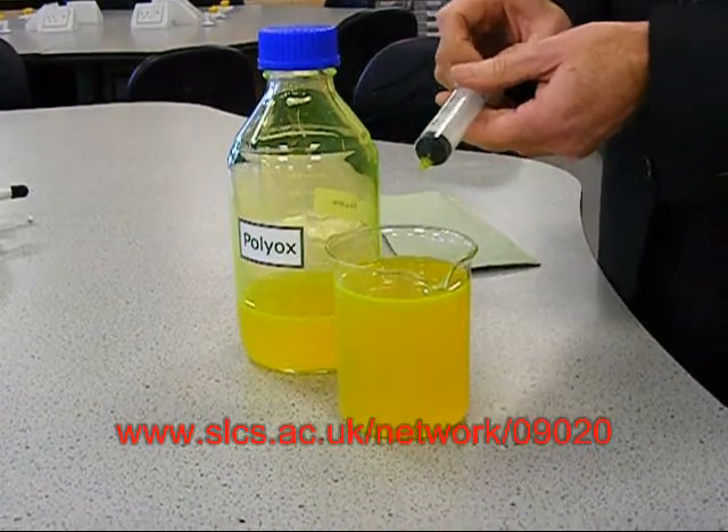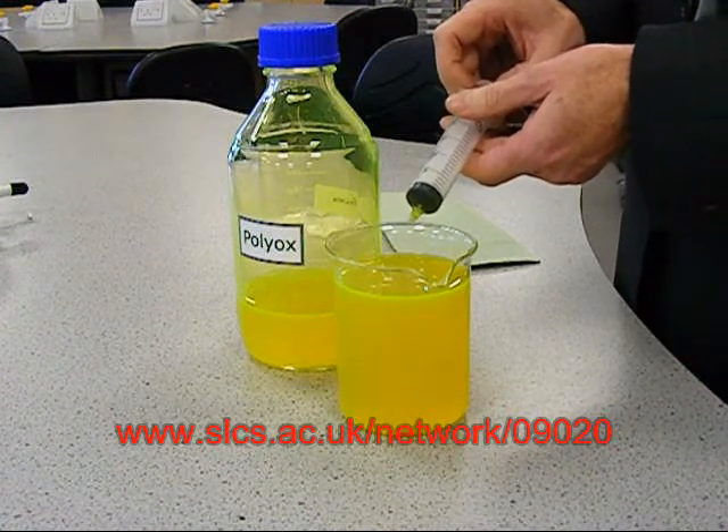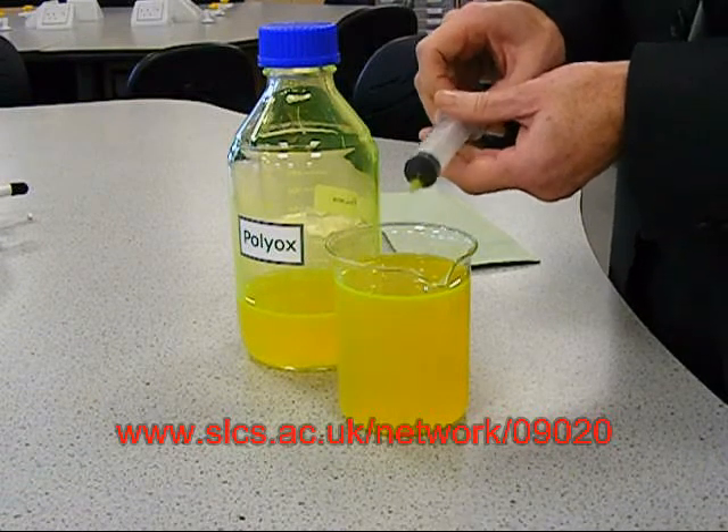One word of advice: make sure that you're in your best white suit before trying this. The children will be incredibly impressed when you spill the mixture over yourself, because it contains fluorescein dye, and that will be quite difficult to remove.